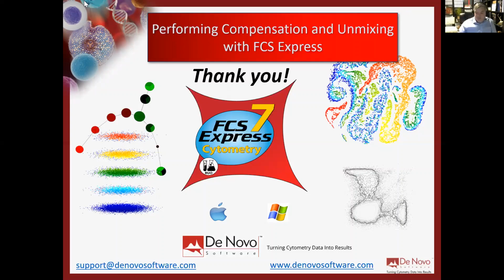Because this is a talk about compensation and unmixing, I just wanted to reiterate that the best thing to always do is to make sure that you have the appropriate controls and understand why the compensation or unmixing might not look correct to you.